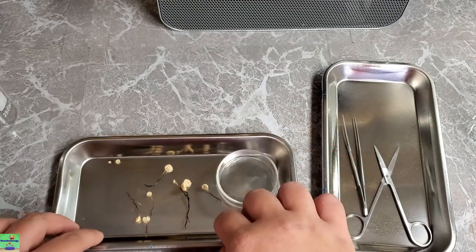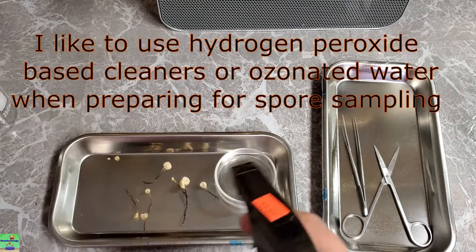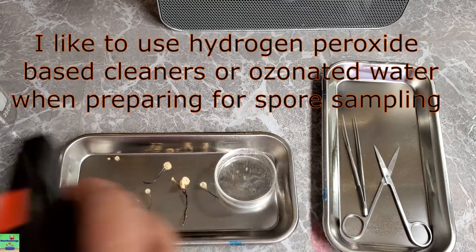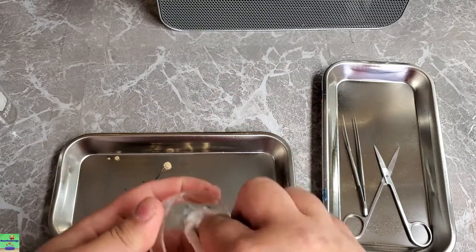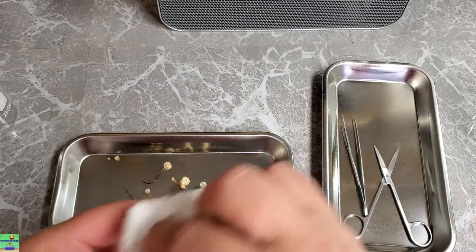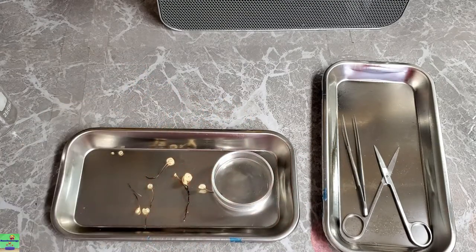One thing I like to do if I am trying to determine the color of a mushroom spore print is to take a piece of paper and take a Sharpie and draw a box with black Sharpie. And then I will straddle the mushroom over that partition so that I can have better contrast for colors to see what the true spore color is. But as far as this procedure goes right here, it's pretty easy.